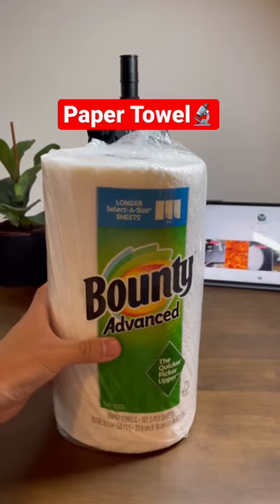Let's see what these paper towels look like under the microscope. I like to use them for everything from cleaning up messes to hand drying. FYI, air dryers are extremely unsanitary, so do not use them in public restrooms.